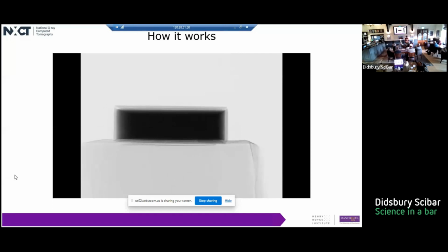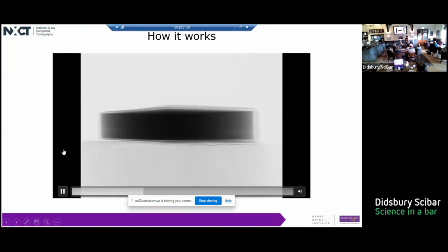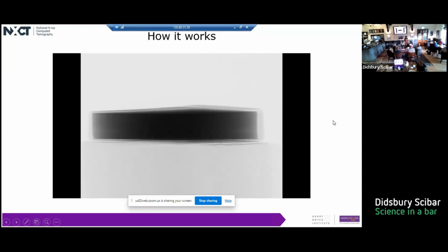And that's important because the more X-ray images we take, the higher resolution our data can be. It's a bit more complicated than that, but let's just go with that. And also you can see how we've got a nice grayscale contrast between our backgrounds and our deck of cards, which has a nice sort of grey. And you can even see when the angle is just right, you're actually able to see the individual cards in the deck.